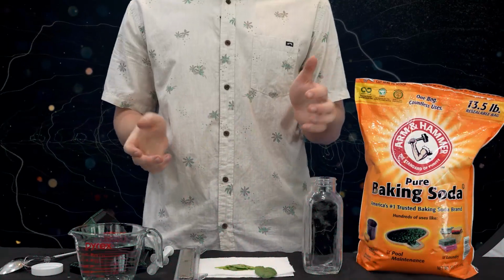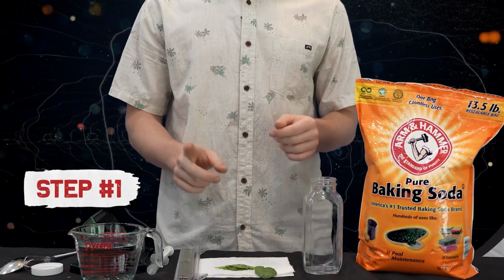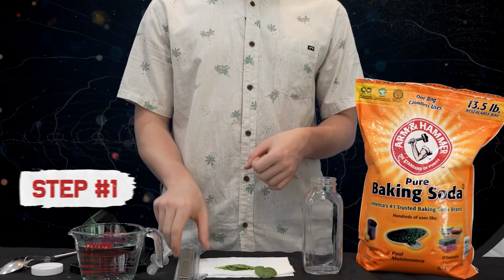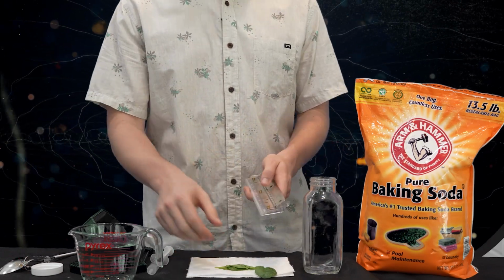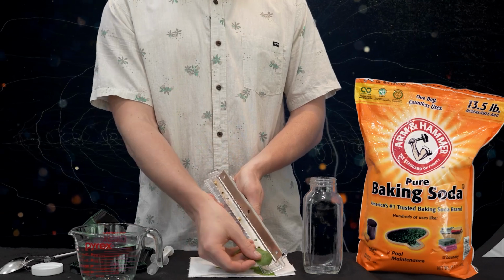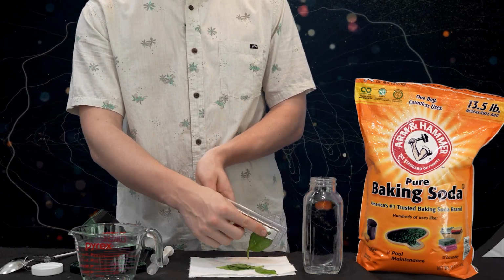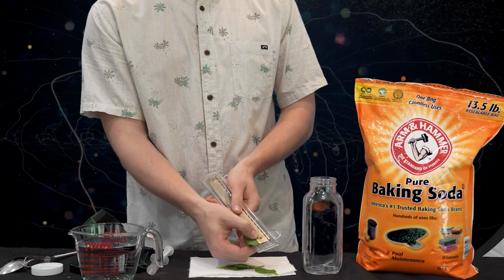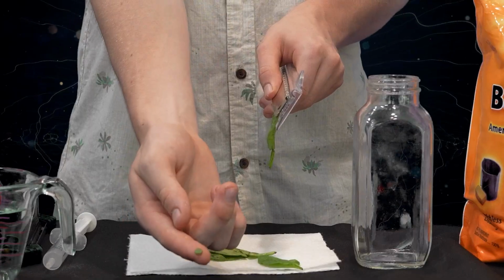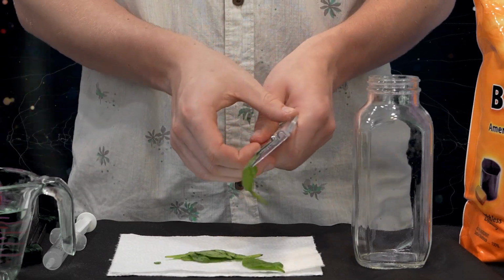So what we're gonna do is split this into a couple different processes. Step 1 is going to be cutting out our tiny spheres with the hole punch. So all I'm going to do is take my spinach leaf, put it on top of one of these holes, cover it up so you can see that there's some green underneath that hole, and you just snap it, you have a little disc. And then you just repeat that 9 more times so you have 10 discs in total.